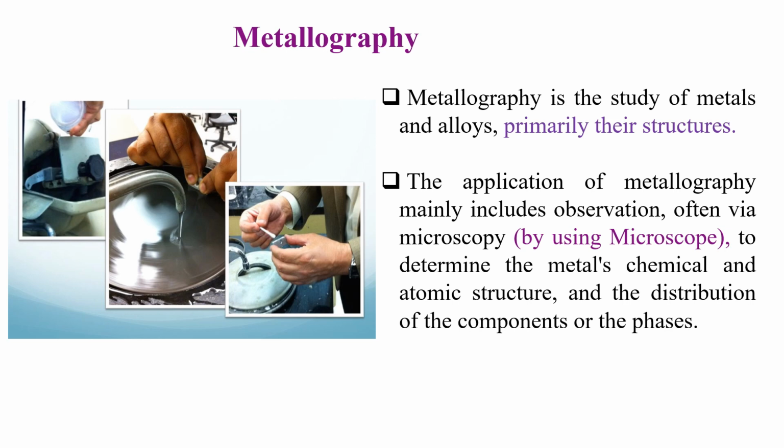Again, what are the various basic steps and what are the various devices used to find out the actual structure of a metal, which is related to metallography in the engineering metallurgy subject? So let us start with metallography.